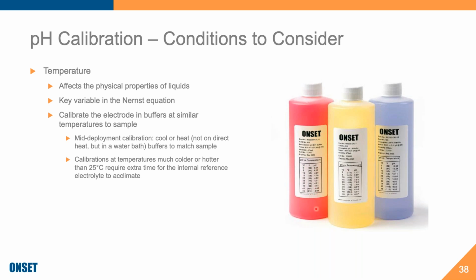So one thing with pH 4 is it's a very stable pH buffer. It maintains value really well. It maintains value at different temperatures really well. As you can see, it's 4.01 and then 4.00 for a lot, and then 4.01. It's only at the high temperatures where you start seeing it changing.